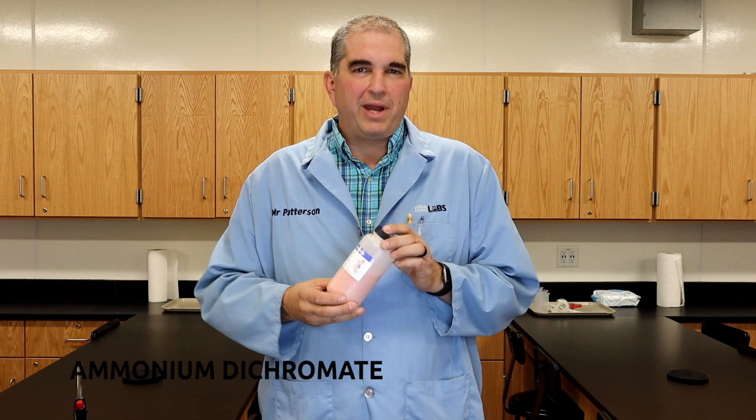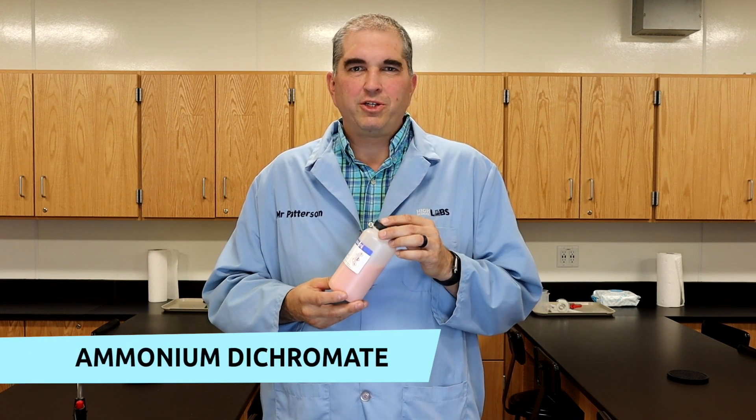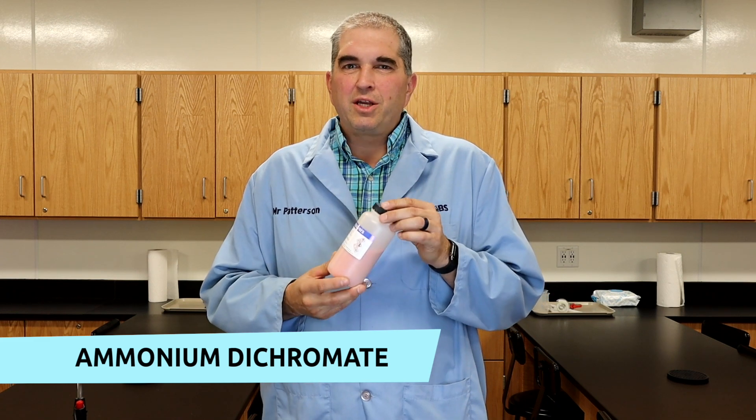Hi, I'm Mr. P from Answers in Genesis. Today, we're going to do an experiment that's going to generate a cinder cone volcano. We're going to use ammonium dichromate. This substance is going to undergo a decomposition reaction when we heat it up, and it's going to break down into simpler parts and create this cinder cone.